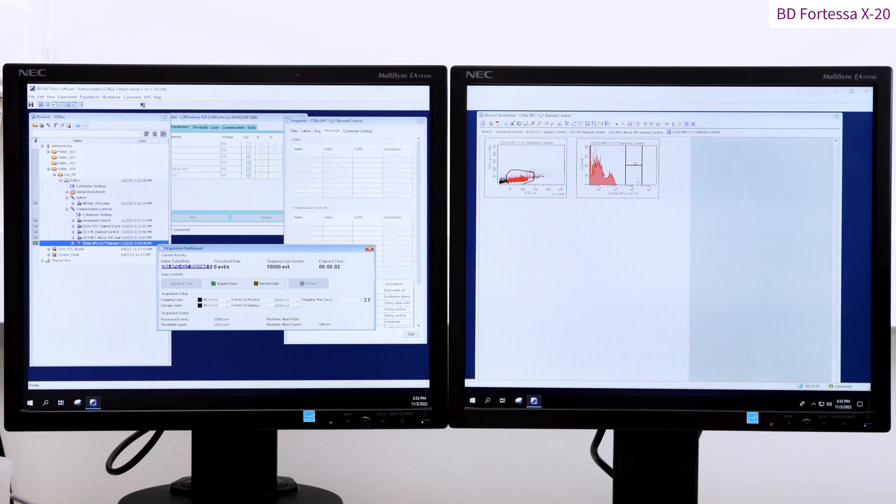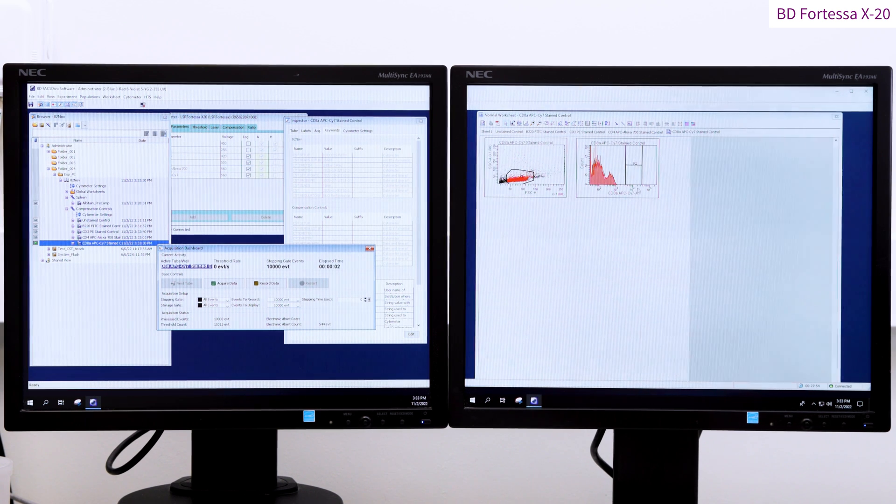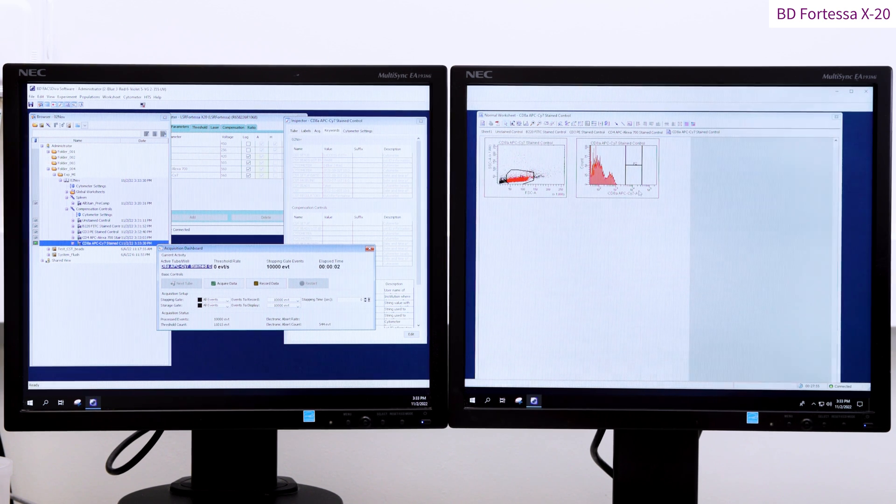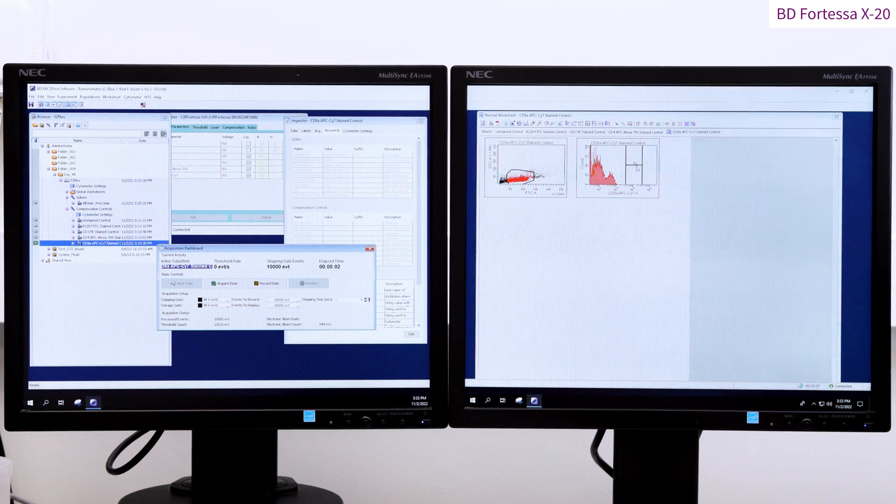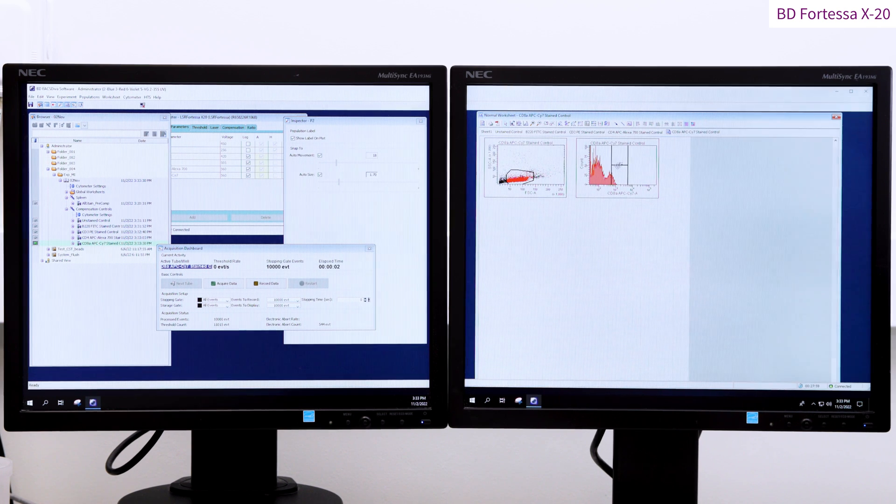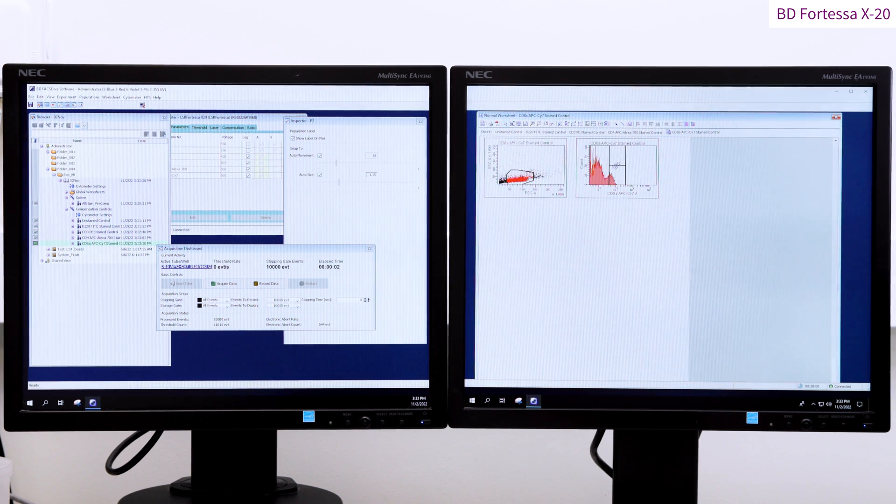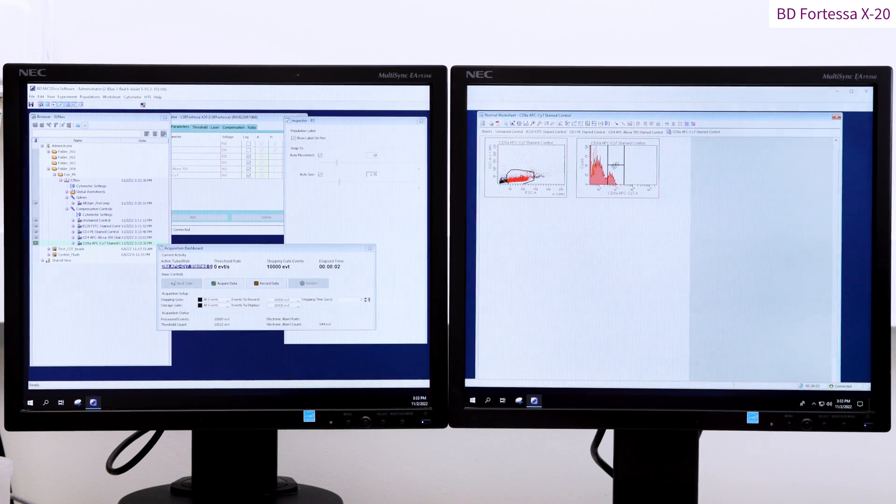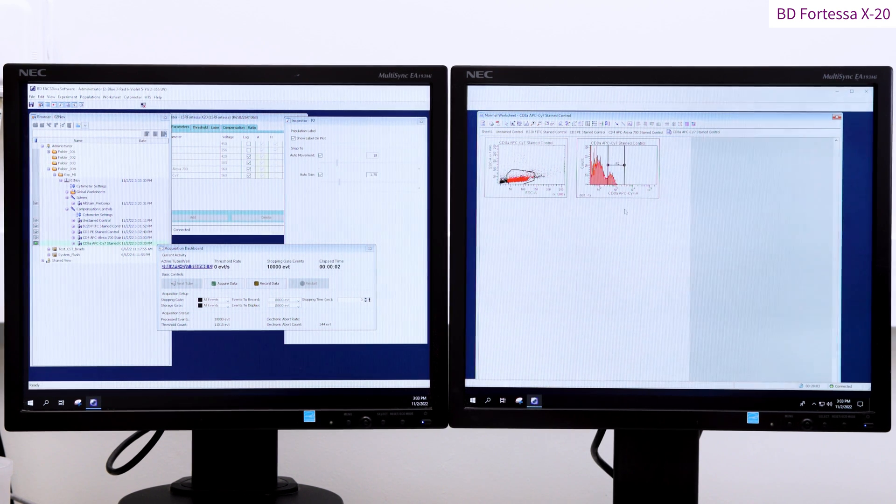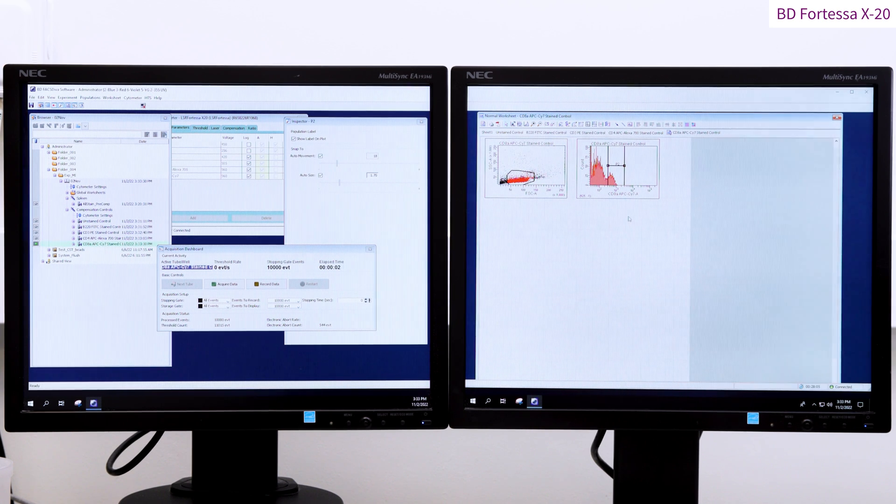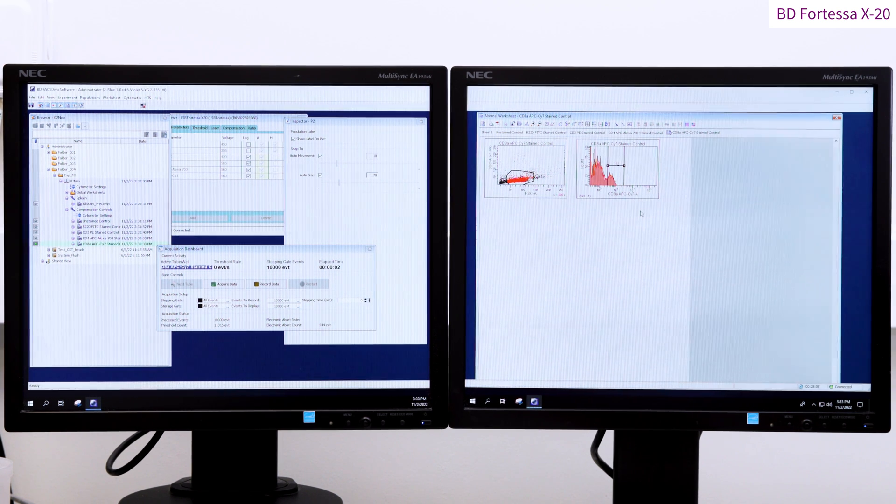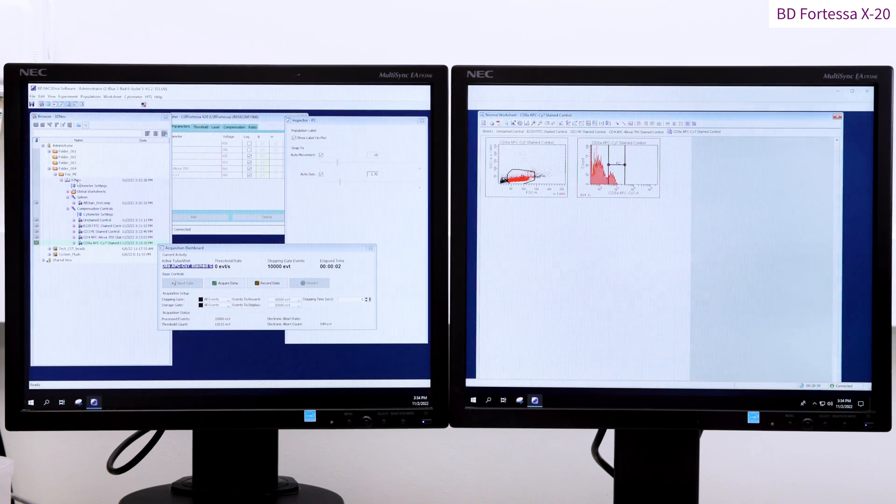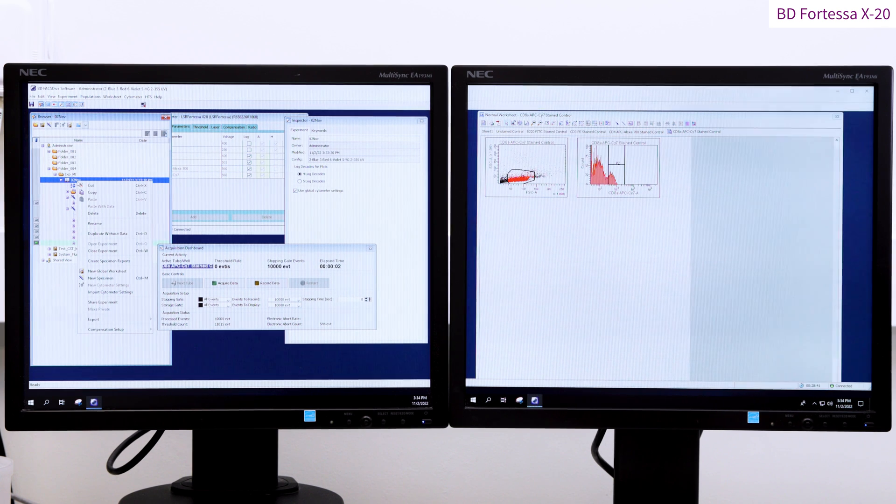Each single stain can now be recorded. Most of the time Diva automatically readjusts the P2 gate to the adequate positive peak. However, there may be some cases like here with this weak CD8A APC Cy7 where you will have to manually readjust the P2 gate location.